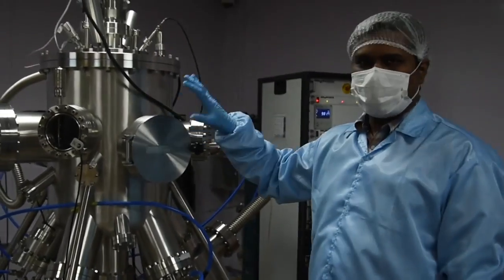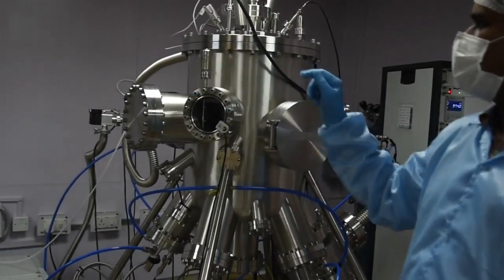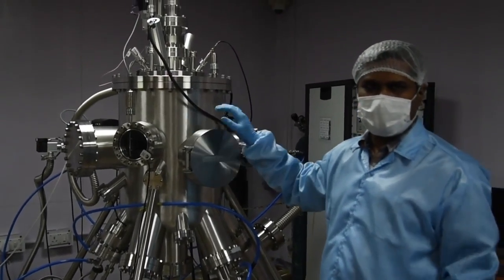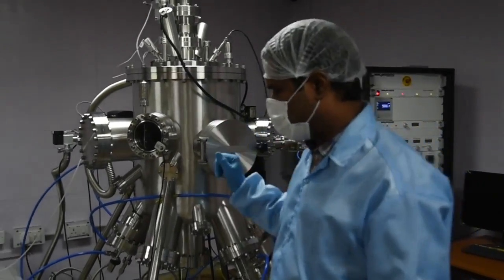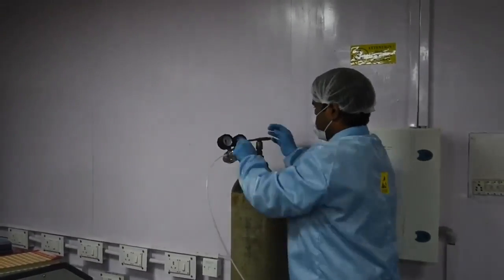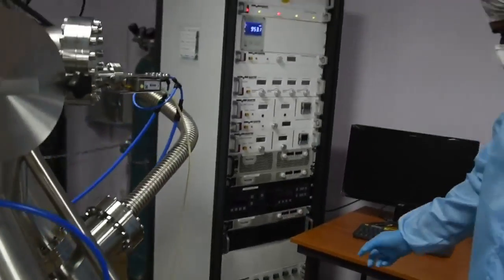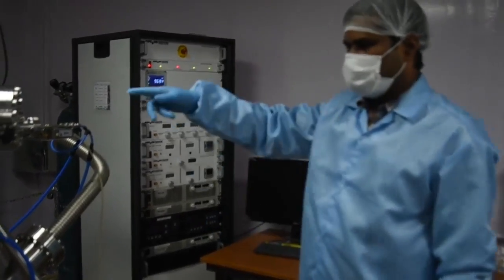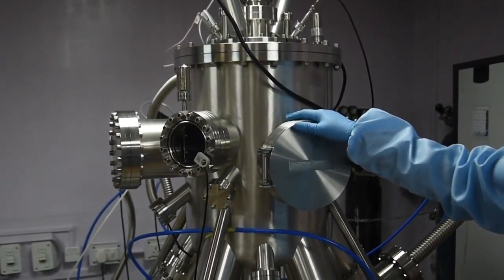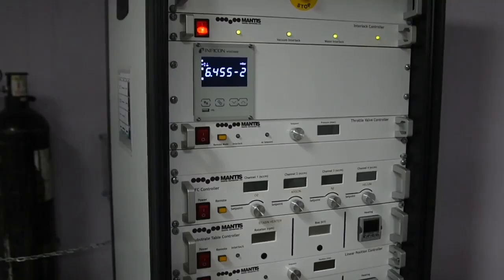The loading is complete and the chamber is now at atmospheric pressure. We have to evacuate it and create vacuum. For that, I have closed the vent valve and I am now opening the backing valve and starting the rotary pump, so that a vacuum of 10 to the power of minus 2 mbar is created. Within about 40 minutes this will evacuate the chamber to 10 to the power of minus 2 mbar.